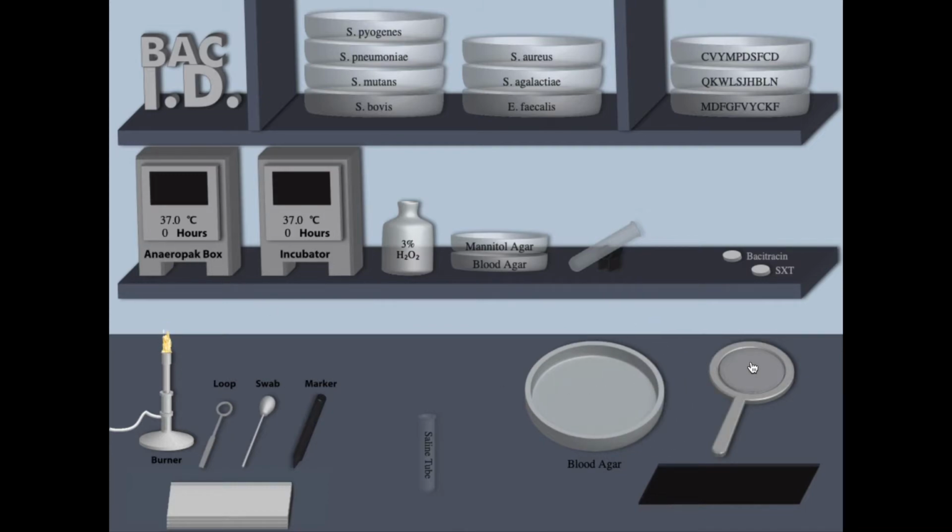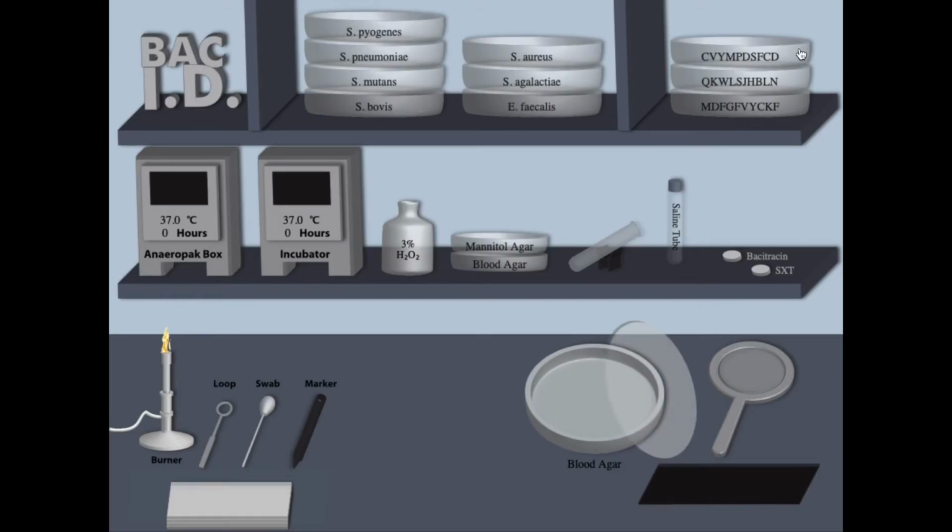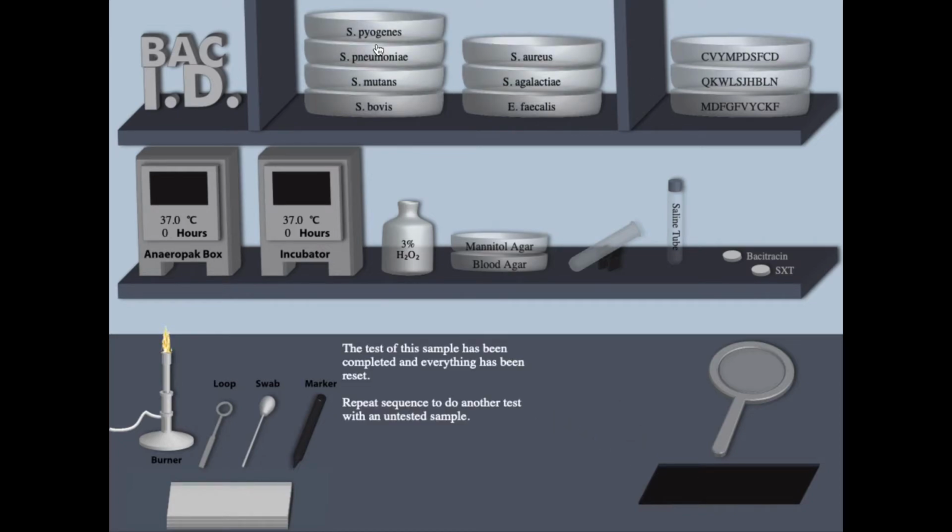Repeat this blood agar test for the other samples of Streptococcus bacteria. Do not test any Staphylococcus bacteria using this procedure.